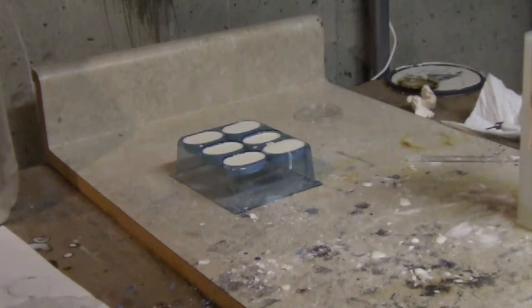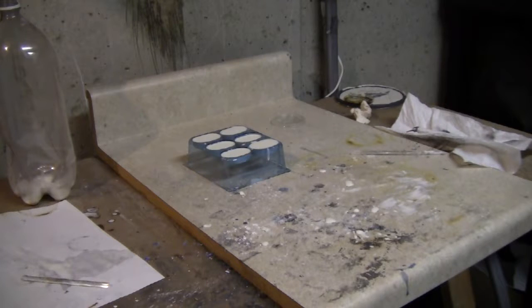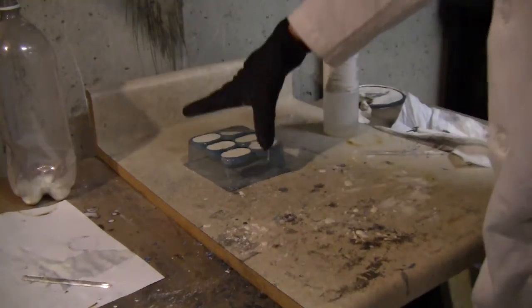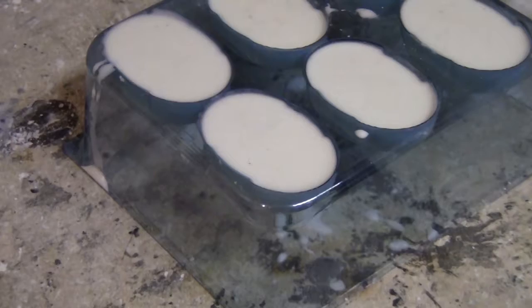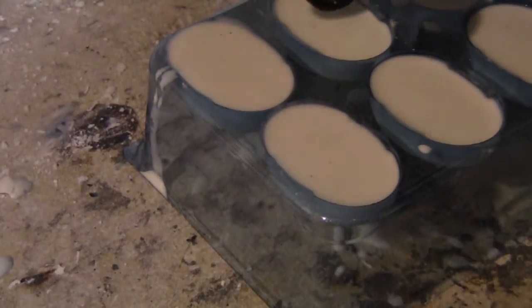Pretty interesting stuff. So today, I've brought one of my favorite chemicals over, sulfuric acid, and I'm going to be seeing what happens when you put sulfuric acid on Ooblek. And this is extremely pure, known as reagent grade. So now, let's do this.